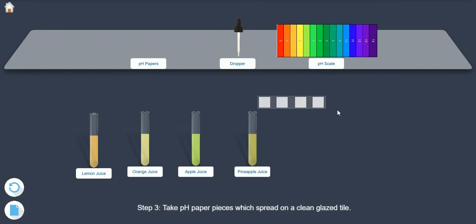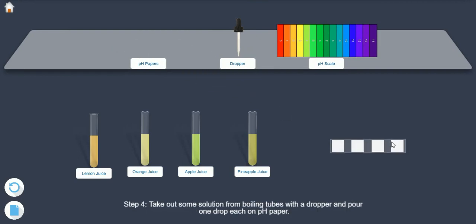Step 4: Take out some solution from boiling tubes with a dropper and pour one drop each on pH paper.